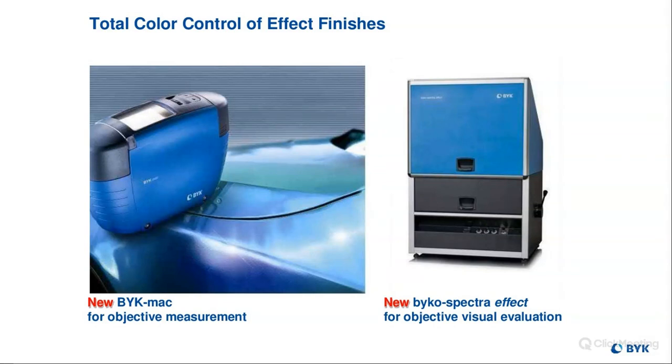And then you look through a porthole, essentially, with your sample inside on a platform, and with a handle on the side, you can change the angle, and it'll tell you where you're at. So you can go from a 45-degree angle to a 110-degree angle, and you can have 2 panels in there, and you can see with diffused light or direct light how that sample is reacting.